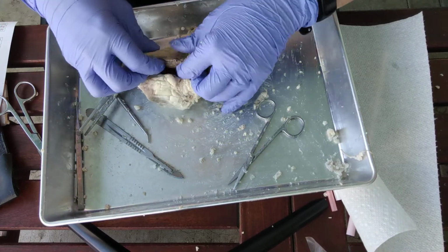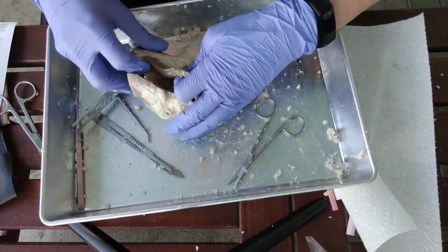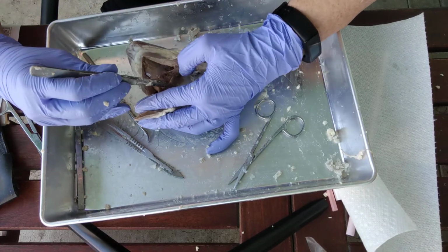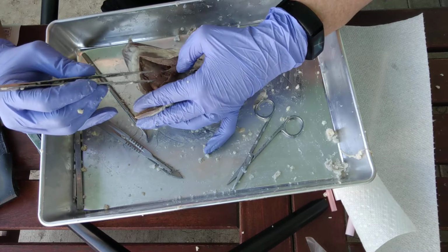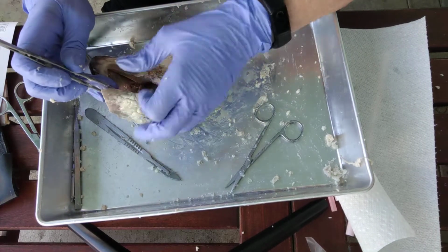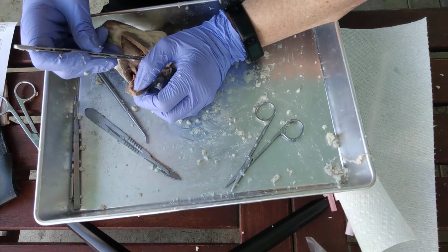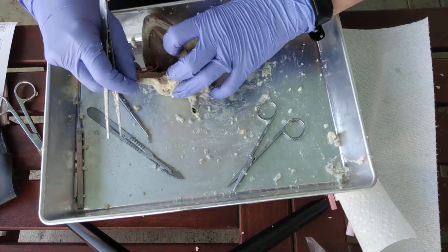Okay, next we're going to try to find the tricuspid valve. The tricuspid valve is called the tricuspid valve because it'll have 3 cusps. A cusp is a flap, so you can look for 3 cusps. Here's 1, here's 2, and the third one is on the same wall that we just opened. So it'll make a triangle shape, 3 cusps.